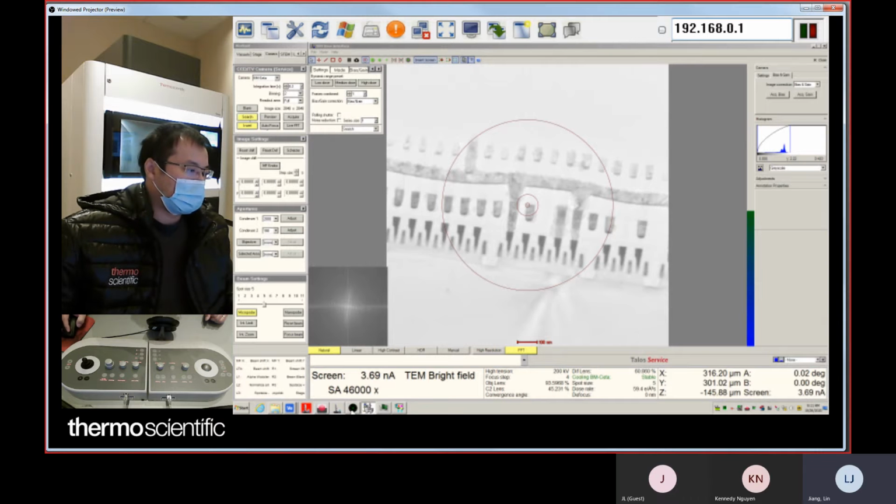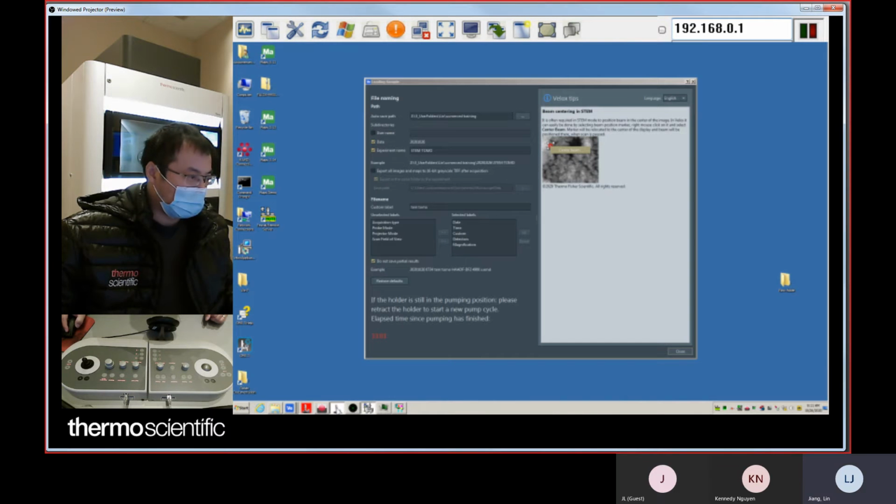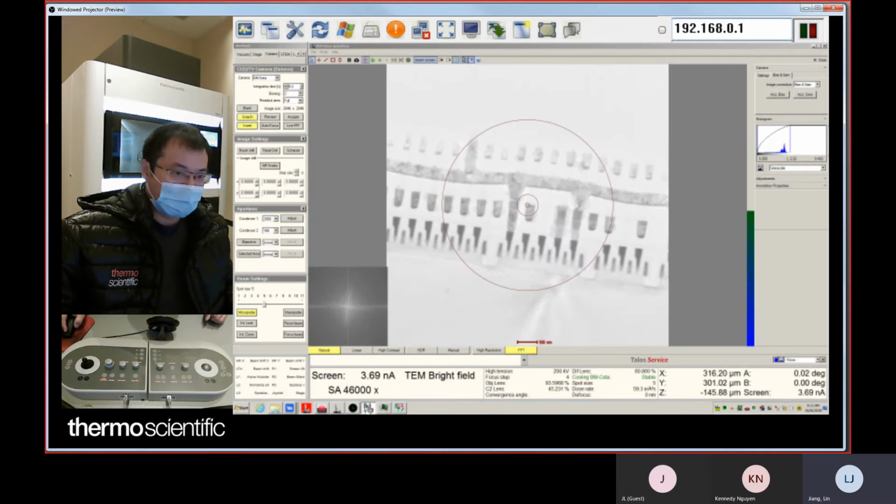In the preview window, you see here. Let me see. It's here.